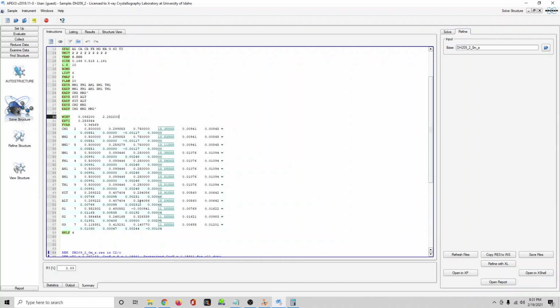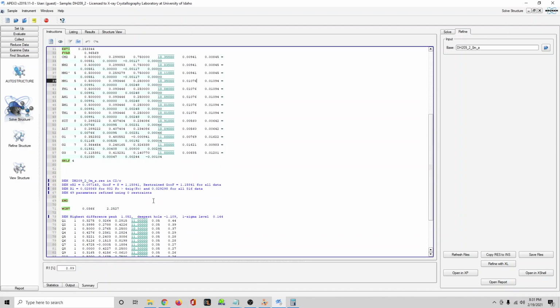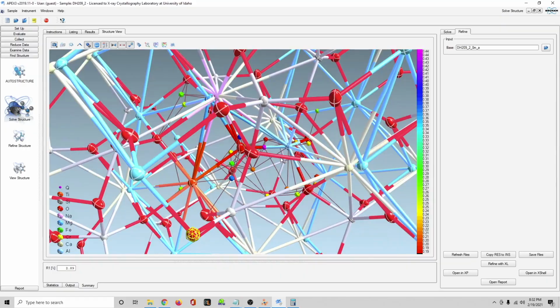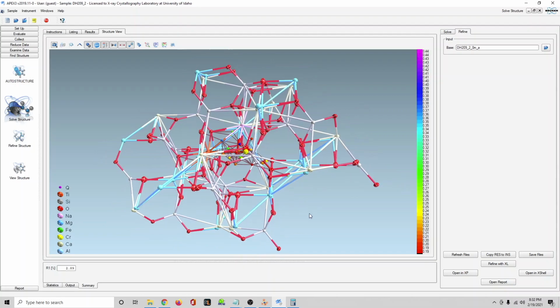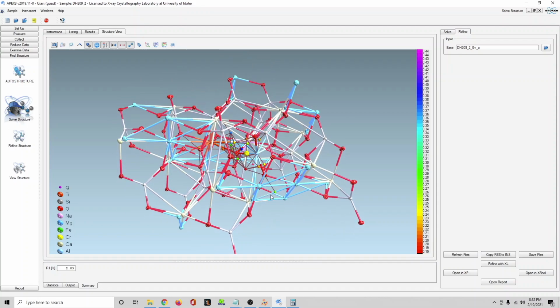Because you're not having a bunch of variables that are just numerically optimizing what you want the result to be, which is an R of 0. But this is like a real life thing where we know what the constituents are. Maybe some of my decisions about the sites were a little bit off, but this is how you'd actually use chemical data and refine a bunch of stuff. And if you did this, you may find something else out about the structure that you didn't know. You can see that weird pi bond artifact is still there, but maybe you can find something else because you have fixed things that you know about the structure now, and you can refine atomic positions and have an overall more correct thing here.